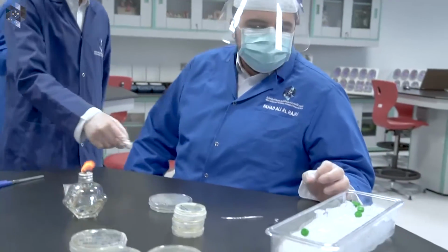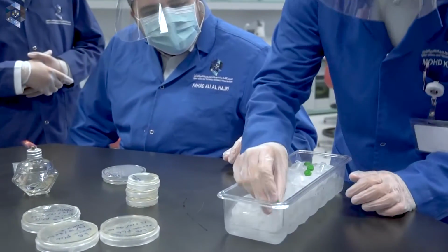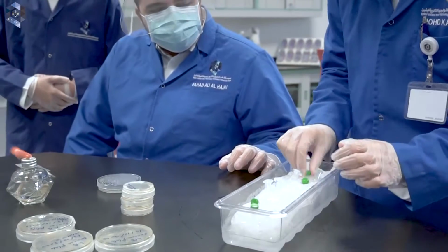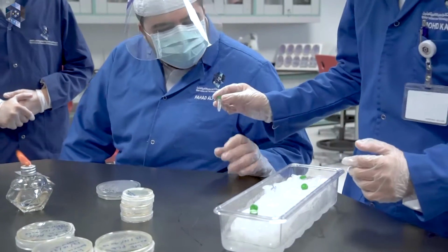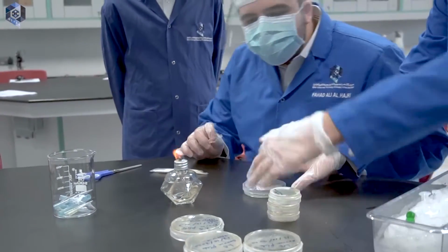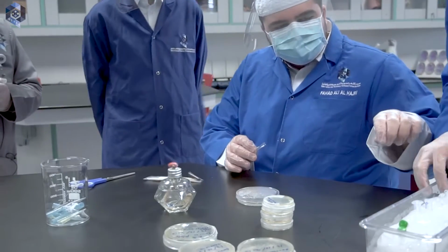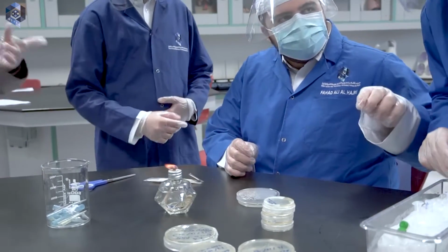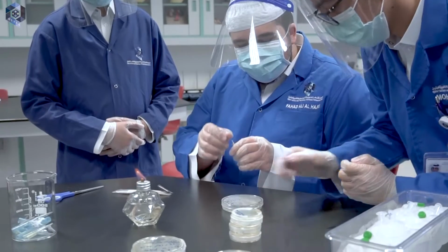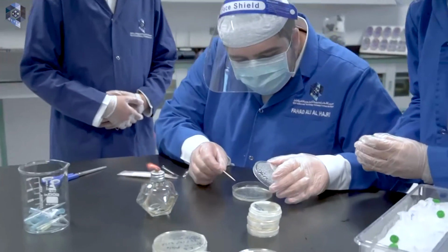Which tube should I use? Which one did you use? Put it in the corner. We use the same. This is up to you. I have so far prepared 4 different source plates for you. You can either use this same source plate or choose another one. It's okay. Open it. Choose 5 fully grown bacterial colonies.